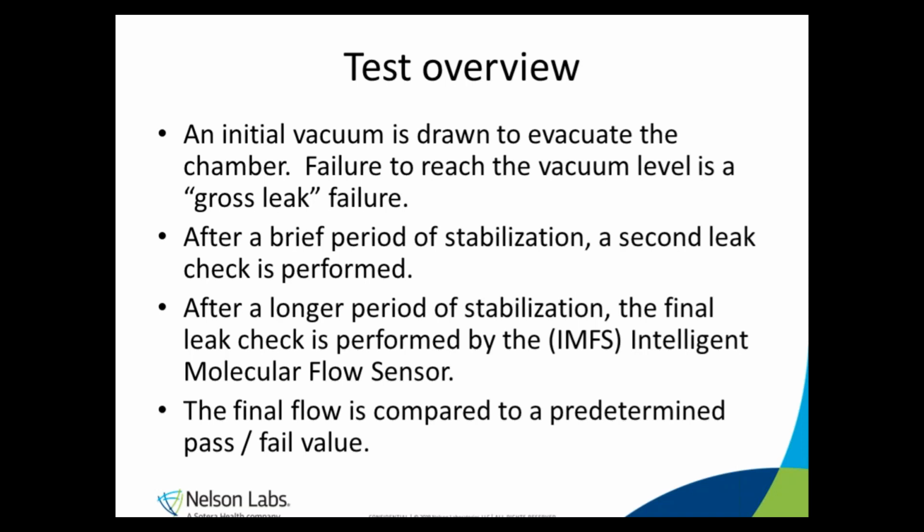sensitive on the market. In fact, ASTM F3287, which is the standard test method for non-destructive detection of leaks in packages by mass extraction method. That's the ASTM standard for mass extraction. That says that mass extraction method is capable of detecting leaks down to maybe 1 micron in some test configurations. Again, we've chosen 2 micron tests so that we don't have to optimize everything quite as tightly as you would need for the 1 micron.